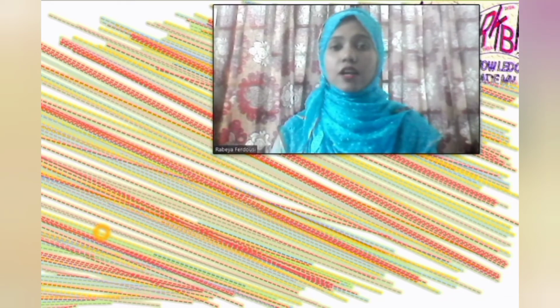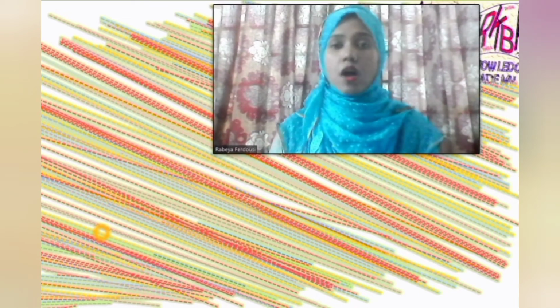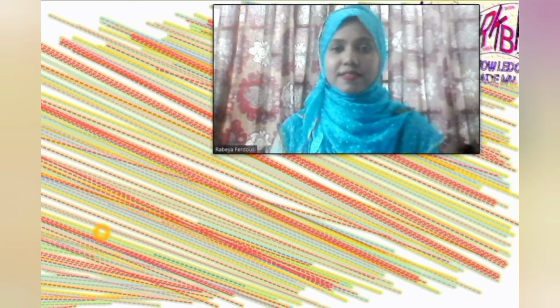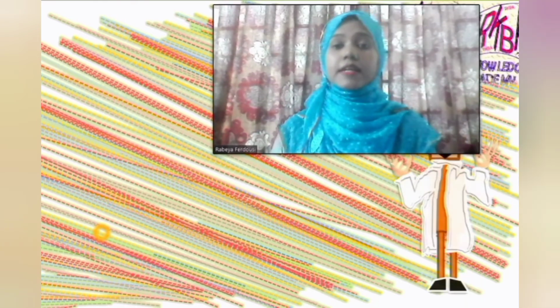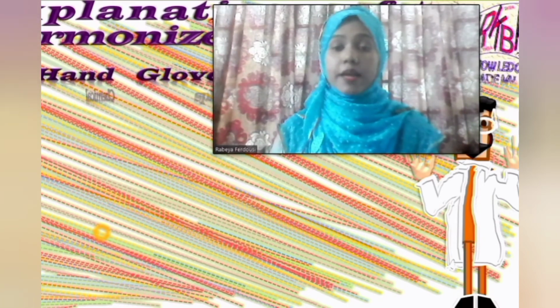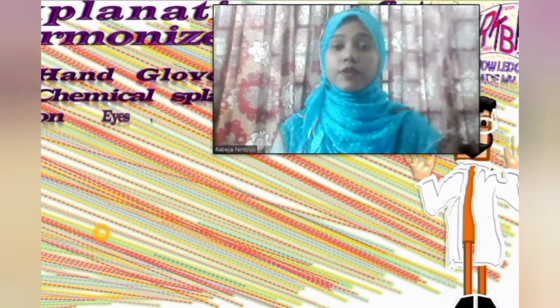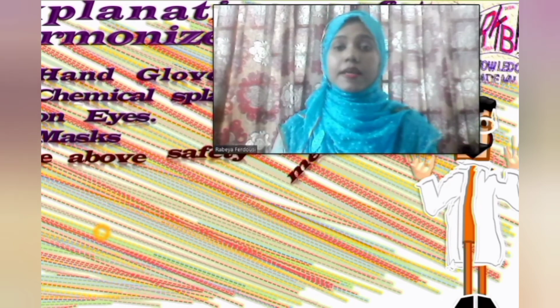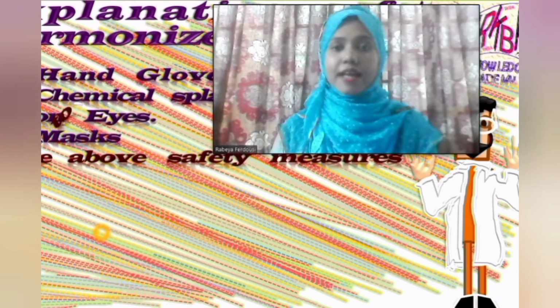Number 2 is hand gloves in hand. Since we have to handle various types of toxic, hazardous, corrosive substances in a laboratory, it is very important to wear hand gloves so that we can save our two hands. Number 3 is chemical splash goggles on eyes. Chemical splash goggles are designed to protect the wearer from liquid and chemical splash. So, during any experimentation with hazardous substances, chemical splash goggles are a must-have item.